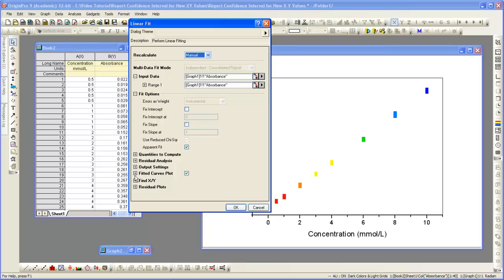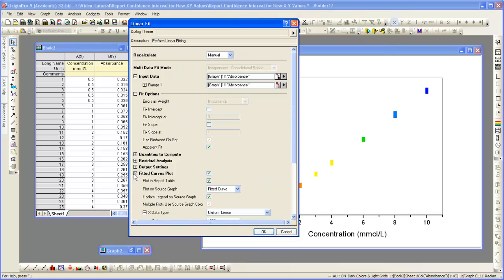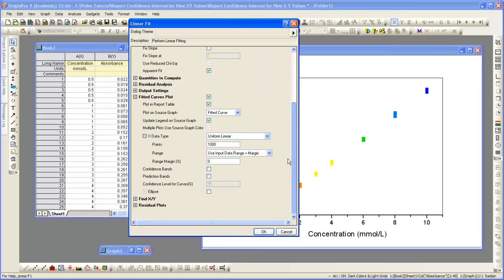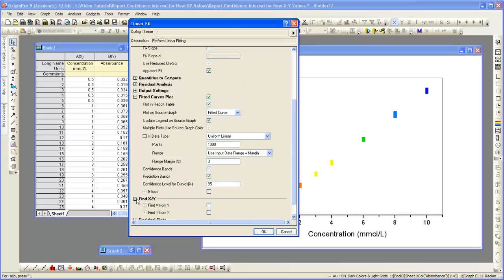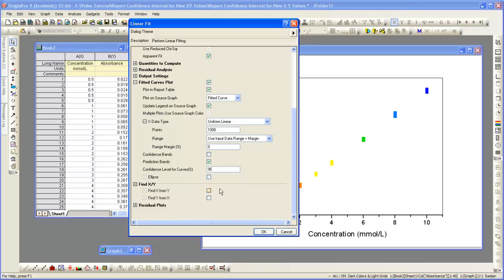We're now going to turn on prediction bands. To find the concentration for an unknown sample, we enable the Find X from Y.